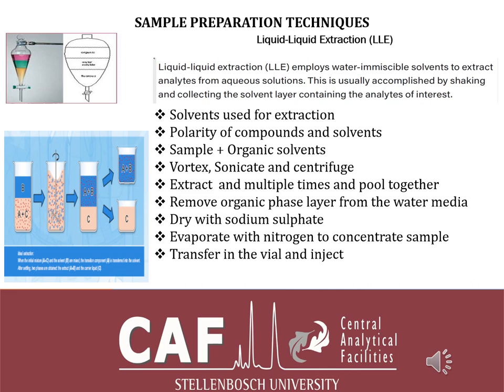And also, just briefly, in more detail about the sample: you've got the sample and an organic solvent. You add a certain volume of your organic solvent and vortex the sample for a few seconds, maybe 30 seconds to a minute. From there on, you put it in an ultrasonic bath, or you can use a shaker, so that your compound of interest goes into the organic phase. And if you're using separating funnels, it's always important to remember to release the pressure every now and then from the top stopper.